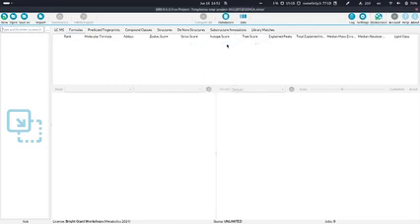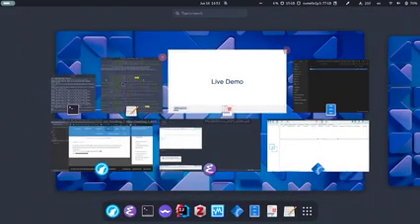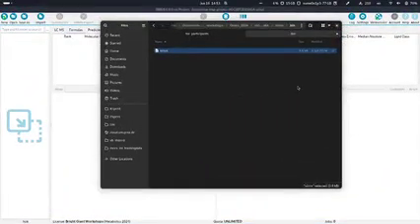And now let's actually load in some data. I already gave you in the data to download a pre-computed project space where the computations are already done. But before we load this, let's just load some raw data.